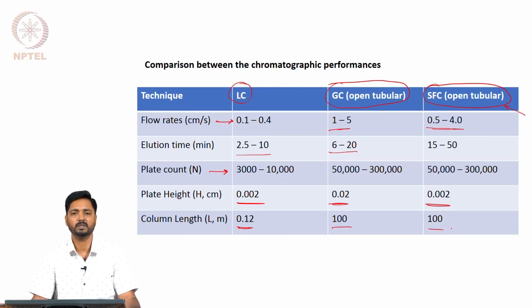Now, it is important also to make note that the properties of supercritical fluids are very intimately dependent upon the pressures and the temperatures that are operating.